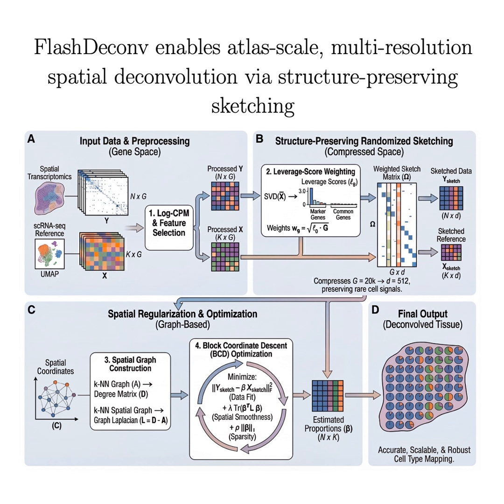But here's the problem. That loudness is naturally dominated by the most abundant cells in your sample. So if I have a massive structural part of the tissue, like all the epithelial cells in the gut, or a big population of glia in the brain, their common genes, even if they're only changing a little, are going to overwhelm the variance rankings by sheer numbers. Exactly. Think of it like a concert hall. You have 80% of the audience singing along to a popular song. They're loud, right? Even if they're not singing anything unique.